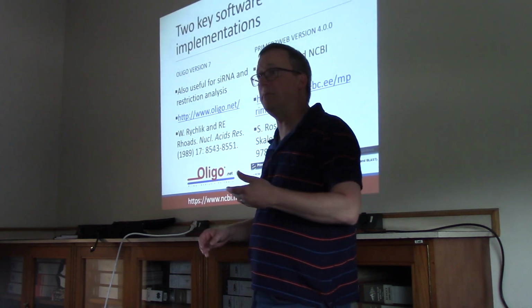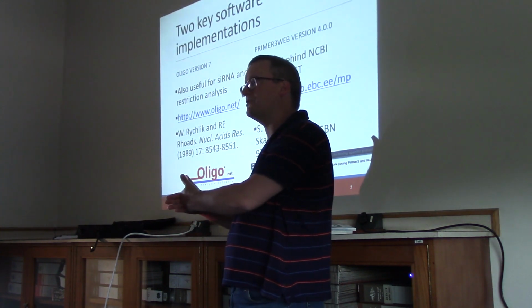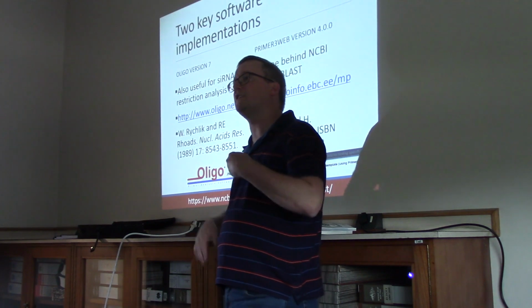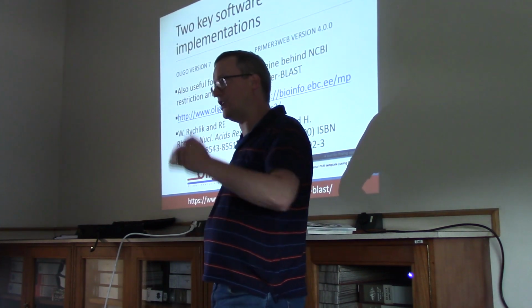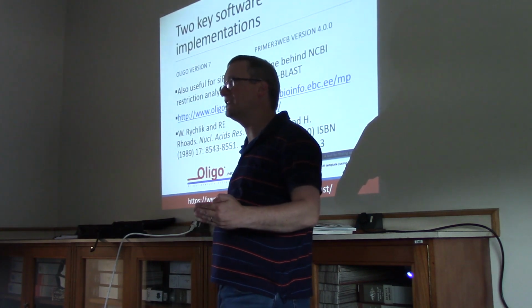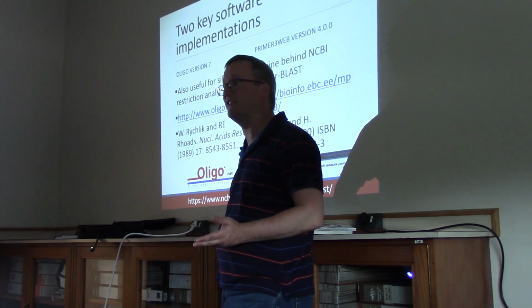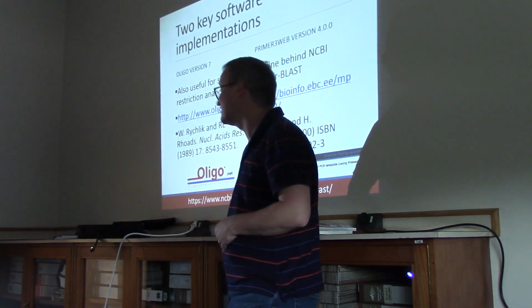But again, to assume that software has been holding still since its original publication is almost always a mistake. In fact, if you find that there's a bioinformatics tool you want to use, but you notice that it hasn't been changing in the last 5 years, it's quite likely that something has superseded it and that it's no longer under active development. It's always worth looking into what's replaced it, if that's the case.